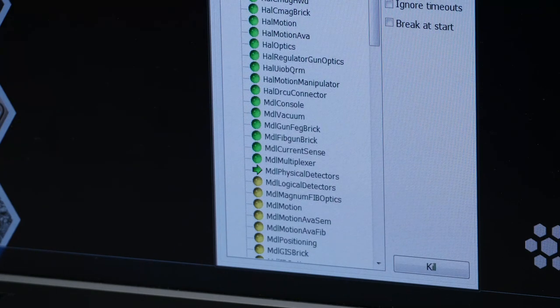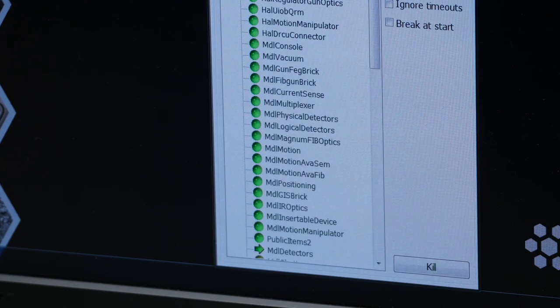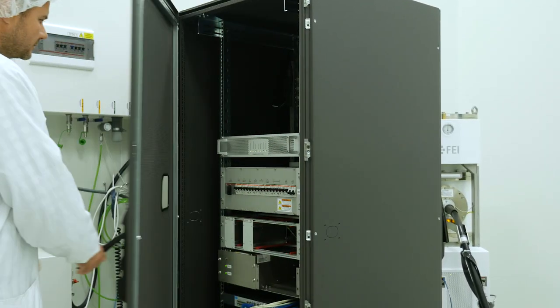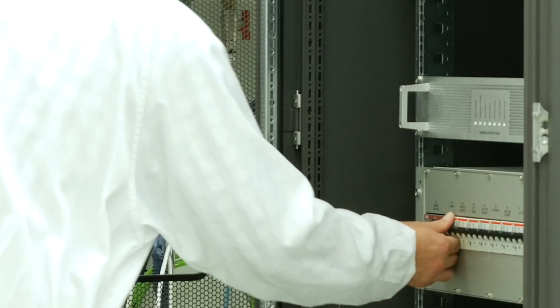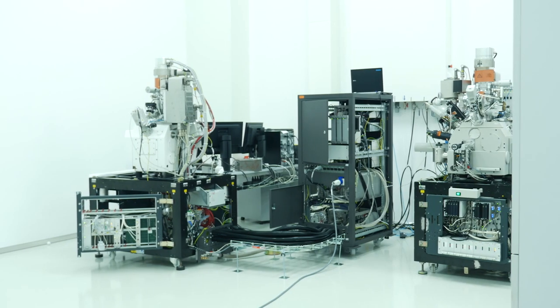Individual regulating modules control subsystems in the microscope and take care of their proper function, safety, and mutual integration. The power units of the computer are placed outside the device so that electromagnetic interference does not influence and disrupt the provided image.